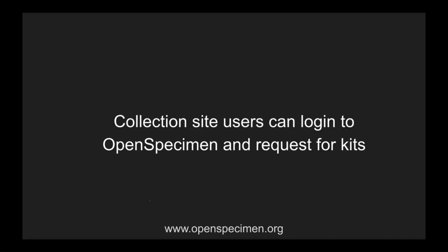So they are not really day-to-day users of OpenSpecimen. We didn't want to provide them the ability to access all of OpenSpecimen, or have them remember a password, because they won't be part of your Active Directory or whatever. They would have to remember a new username and password. So it's all very difficult to do.